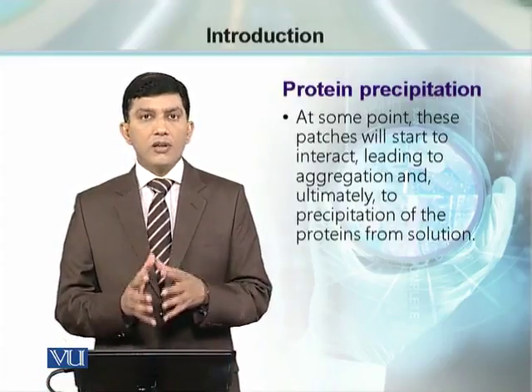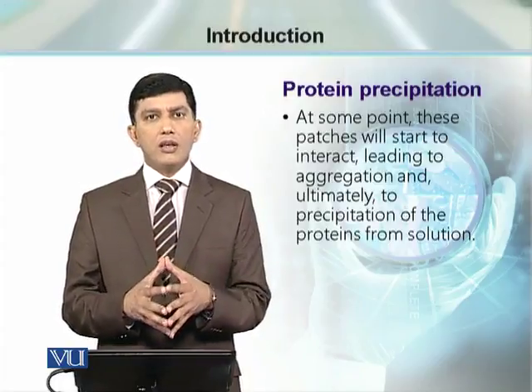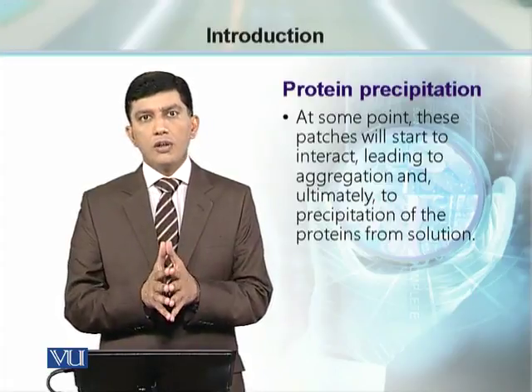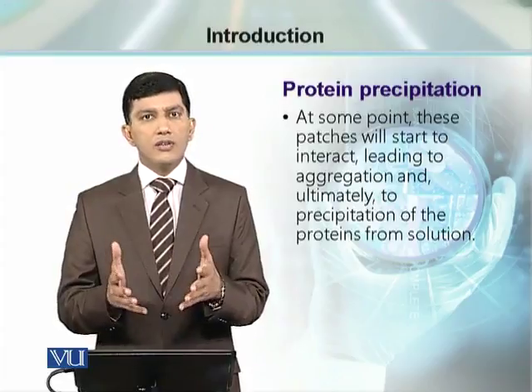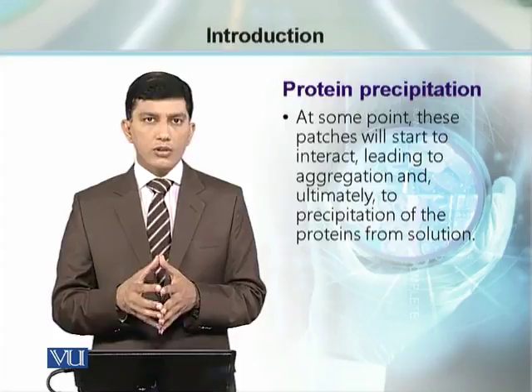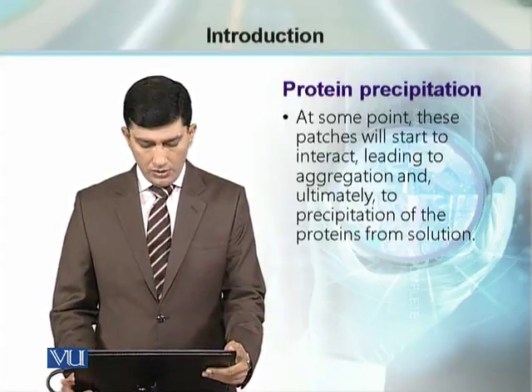इस सारे प्रोसेस में जब हमारे पास इंटरेक्शन के बाद प्रोटीन प्रेसिपिटेट करती है, देन वी हैव मैक्सिमम प्रोटीन in the form of precipitate, and the upper aqueous phase contains this high salt concentration of ammonium sulfate and the water which we can easily remove from the separation.